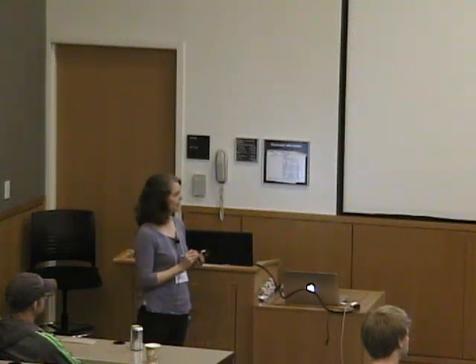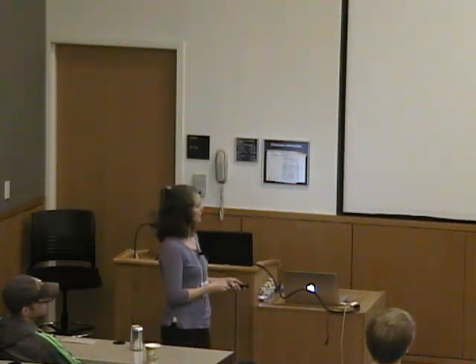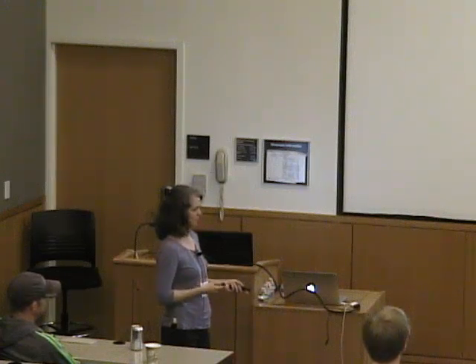Unlike with relaxation, so I mentioned in relaxation, when we're working with metalloproteins, dipolar relaxation really dominates. And so you can usually assume that's the only mechanism. But with shifts, that's not the case. So you have to think about both these through bond and through space interactions contributing to your shifts. But it's worth it because you can get information on spin delocalization, magnetic anisotropy, and a lot of other cool stuff about the systems that those of you taking the practical are doing.